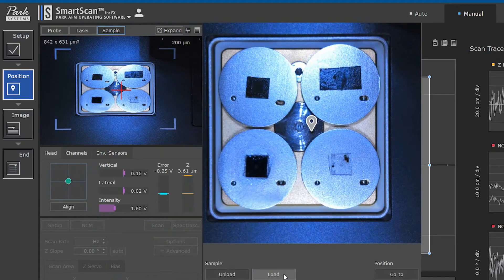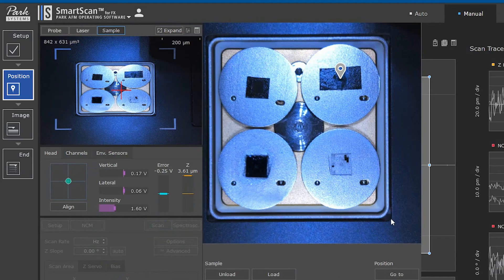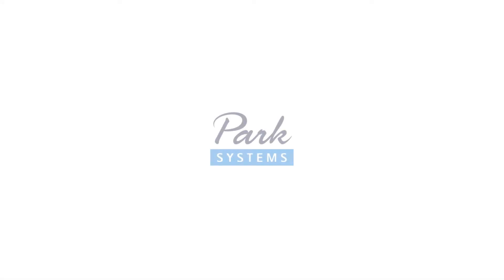Then, the user can select the position of the sample for upload using the sample navigation feature.